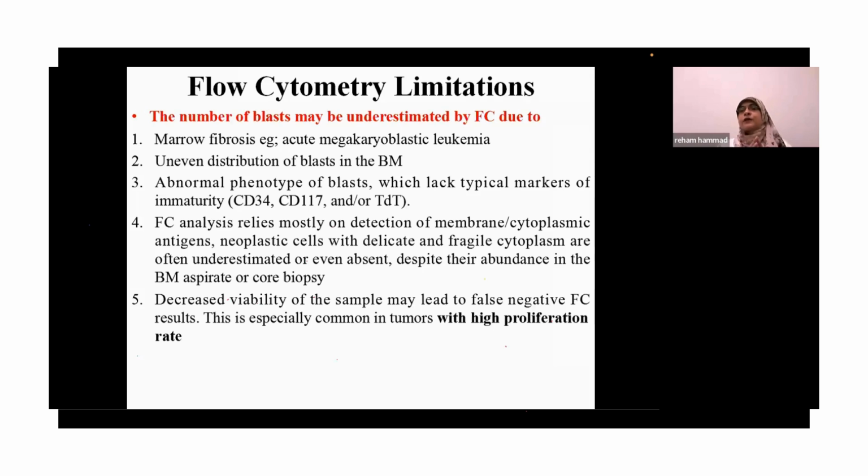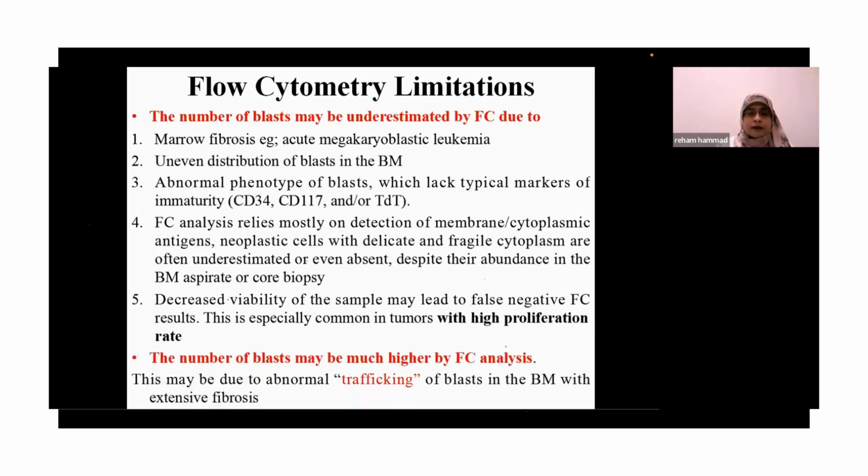So the integrity of the membrane and the cell being alive and using a fresh sample is actually one of the challenges. The most important thing is using a cell which has been withdrawn within 2 hours from the patient. This is not usually applicable. Decreased viability of the sample will lead to false results.